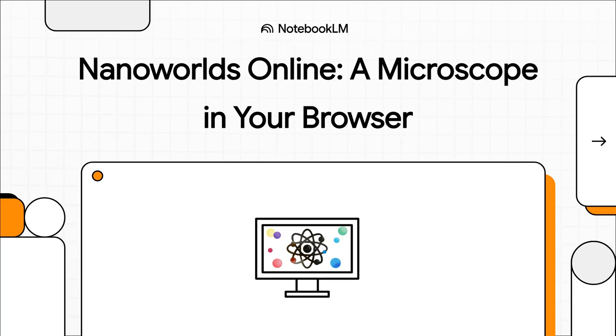Let's talk about seeing the unseeable. I mean, what would it actually be like to peer into the atomic world and see the literal building blocks of reality? Well, today, we're diving into an incredible technology that puts that power right inside your web browser.